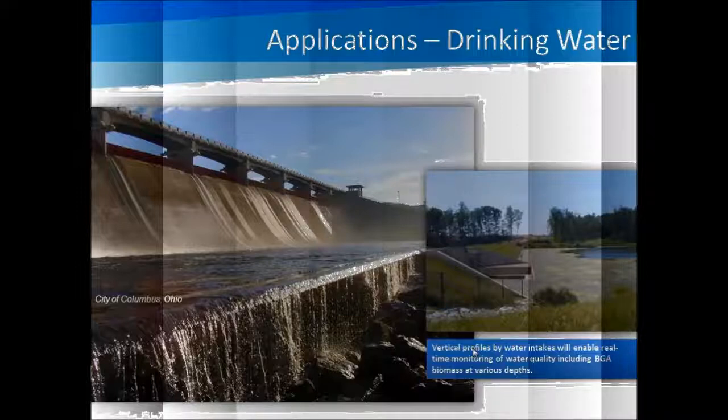And most importantly, with a baseline of data over several seasons, understanding of when the reservoirs will turn over, when blooms may occur, and how long to run mixers can all be extrapolated from the water quality data. So it can be a real effective tool for reducing algae and taste and odor compounds caused by algae.